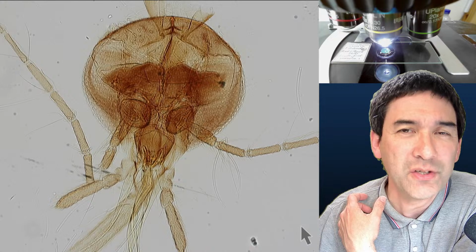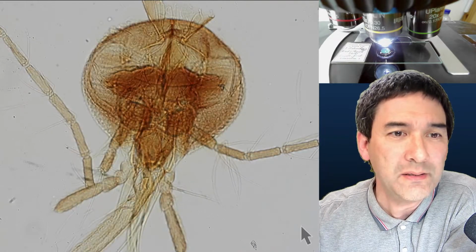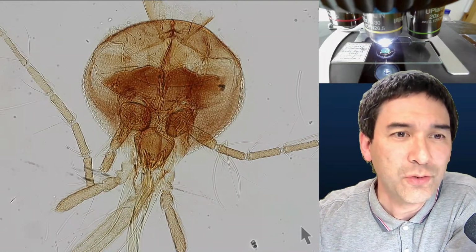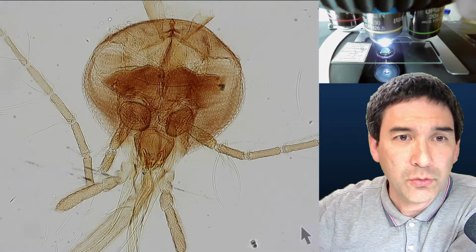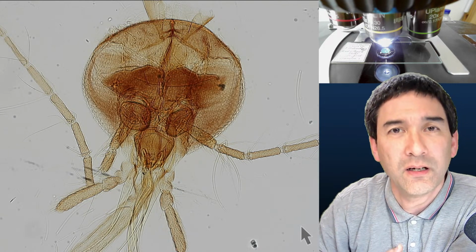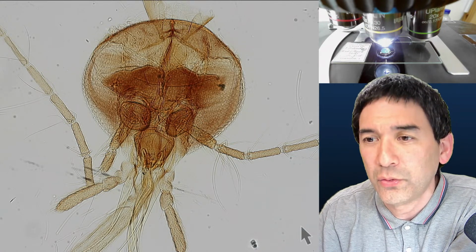For videos, in order to introduce some movement, what I sometimes do is deliberately defocus a little bit and blur it to find the focus. This also captures the attention of the audience a little bit, or I do some digital zooming. Right now, if I zoom in like this, you're jumping in magnification. But if I want to have a smooth zoom, you can do that much better if you have pictures. So that's also a little bit of background info on how I do my video editing.